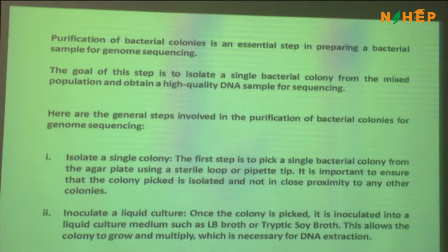Imagine you are taking a streak of bacteria, and in the third and fourth you are not able to get single colonies, or only one stray colony a little away from the streak. Okay, you are picking it up, but there may be a possibility it is a kind of microbial artifact, a contamination. Then everything will go wrong, right? So never ever compromise on that. You should get at least 20 independent colonies that look alike, right? That indicates that what you streaked in the first one is the one you are seeing in the third and fourth. So very important point, okay?